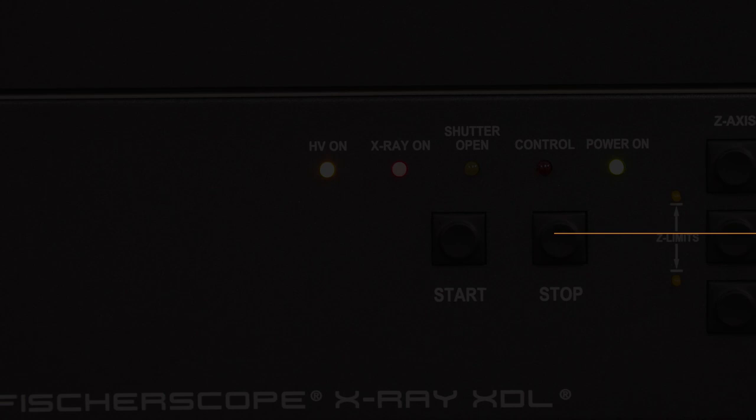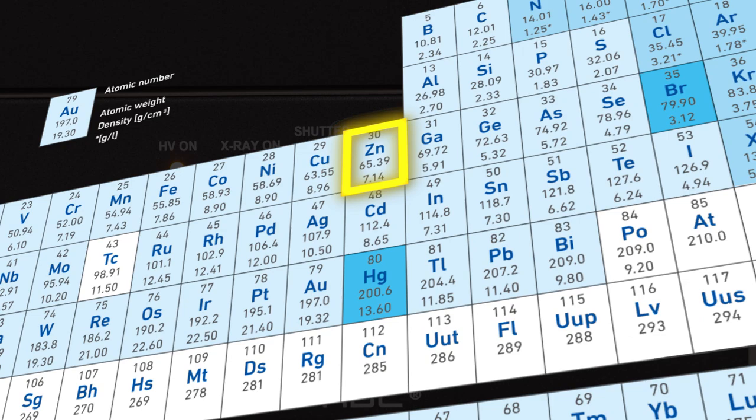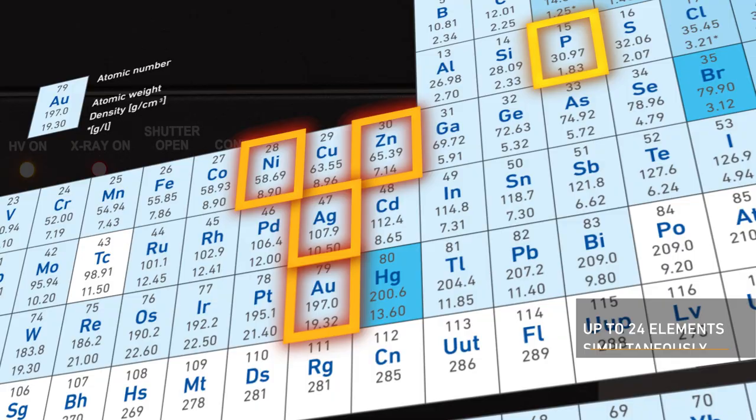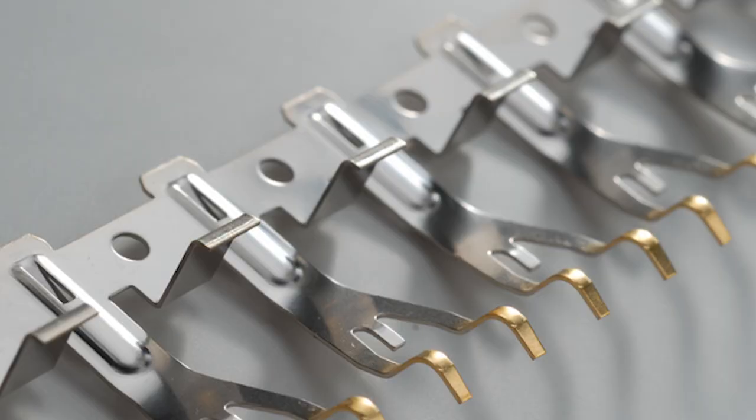What can you measure? You can measure a wide range of elements during quality testing with just this one instrument, from titanium to uranium. Typical applications include zinc, zinc-nickel, gold, silver, nickel, nickel-phosphorus, and others.